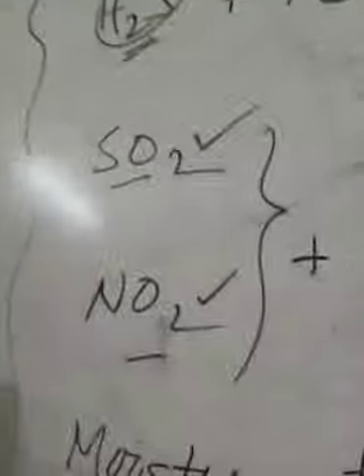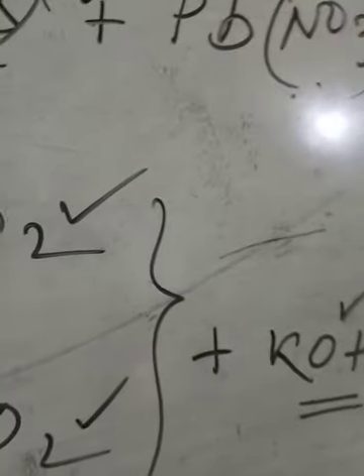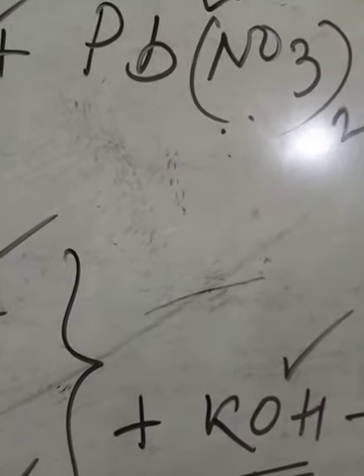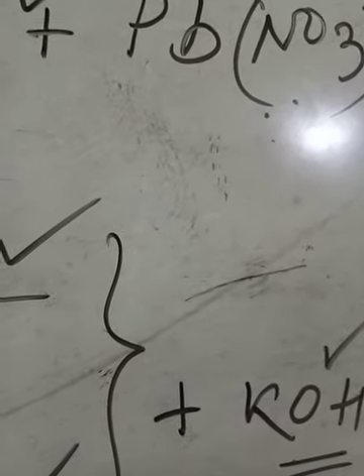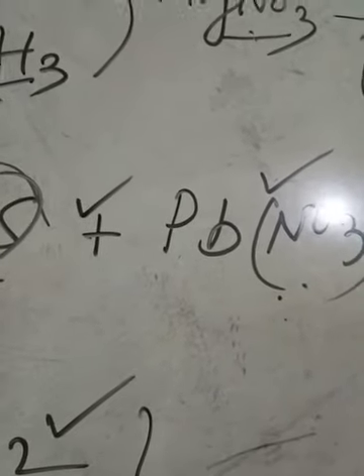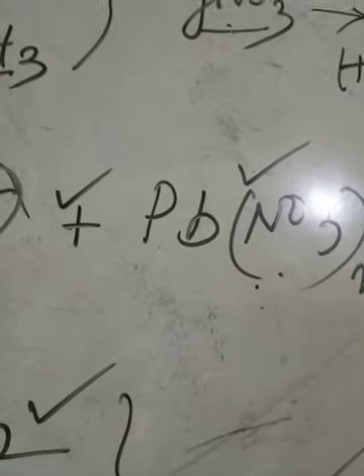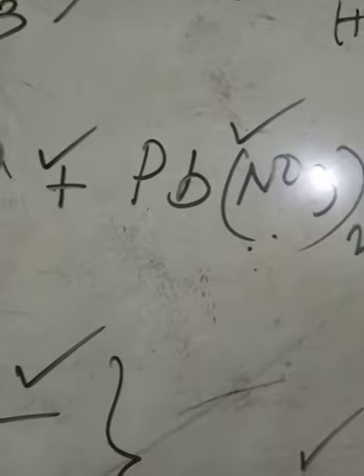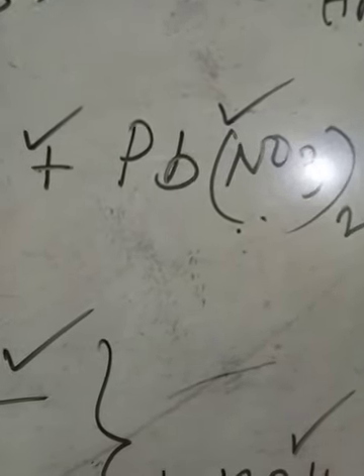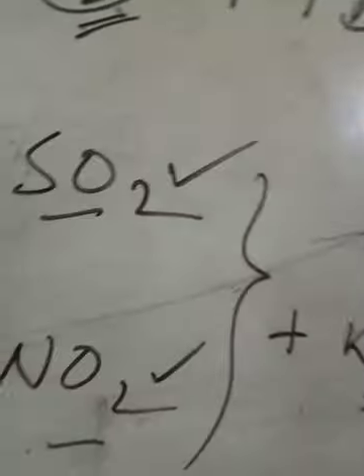These are the preparations of hydrogen. So you have seen the reaction, the reactants, granulated zinc and dilute sulfuric acid or dilute hydrochloric acid. The apparatus we have seen in the diagram: a round bottom flask, a thistle funnel, a side tube, a gas jar, and a water bath. You have to take some precautions and purifications, and last of all, collection of gas by downward displacement of water.